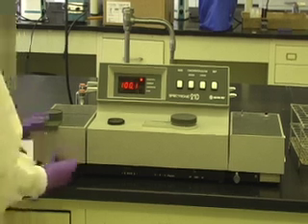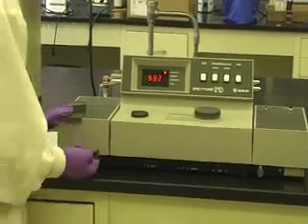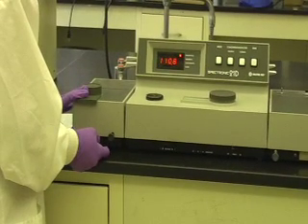Use the cell positioning knob on the lower left of the machine to bring the sample cuvette into position. Read the absorbance or transmittance from the digital readout.